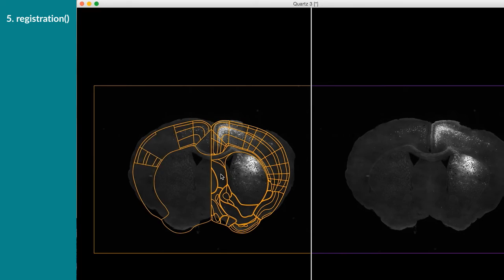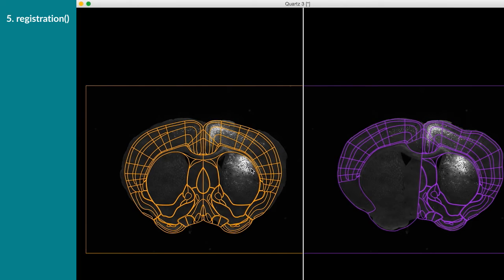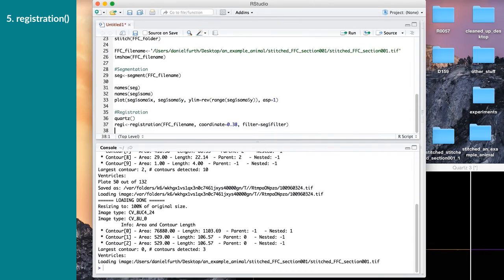So first, on the left, it plots the reference. Basically, this is the WholeBrain atlas, the idealized, and to the right is your fit here now, where it actually estimates that this is where it wants to place. And the way it places this contour is by finding correspondence points, and this is very important in order then to, for example, manually adjust any sort of registration results. You can see here that the point 17 here is a little bit off. It's not in the midline, and there are other things that we might want to actually do something about.